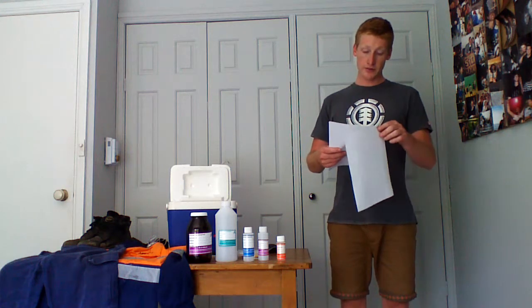Composite samples. Samples collected through multiple grab samples to collect an average water quality characteristic over a selected time or flow interval. Composite samples may be used when the distribution of constituents within the stream are random, increases the temporal and spatial extent of sampling. So for composite samples, you take a different sample along a section of a river, you combine the sample to make a homogeneous sample, split it up, and it increases the spatial and temporal variation of the site.